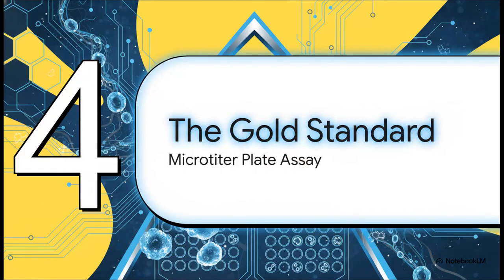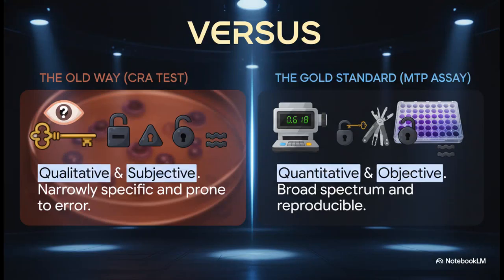Okay, so enough about the problem. Let's talk about the solution. Effective immediately, we are moving to the validated gold standard for biofilm quantification, the microtiter plate or MTP assay. This is how we will be doing things from now on. Just look at the difference.